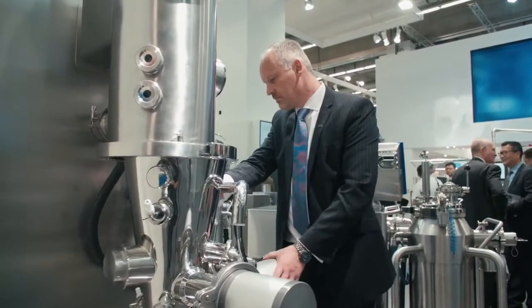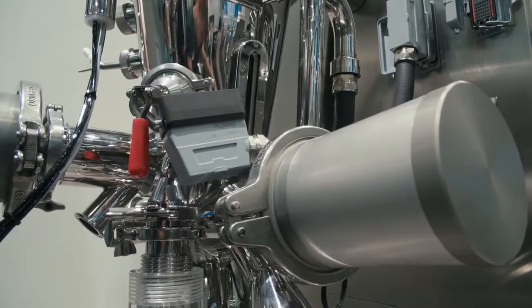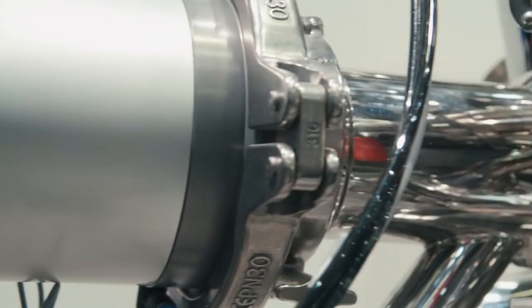The AirConnect system is a fluidized bed processor that gives us the capability of carrying out drying processes, granulation processes, and coating processes. We offer several different systems on there. Our key system is our FlexStream system, specifically for granulation and for coating processes. We also have the capability of adding our Consigma Coater process for tablet coating processes as well.